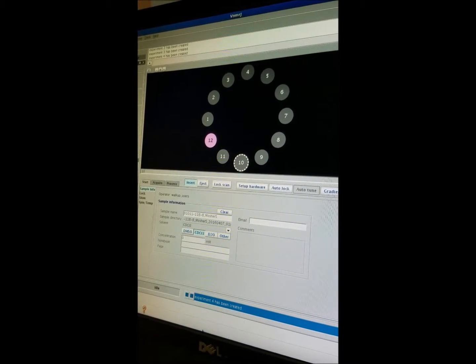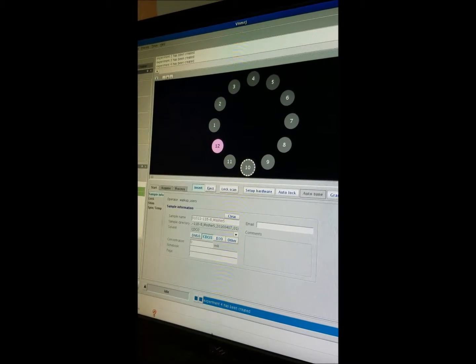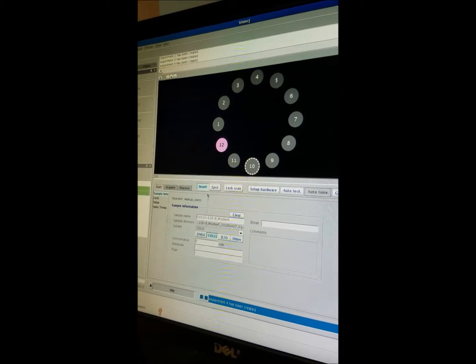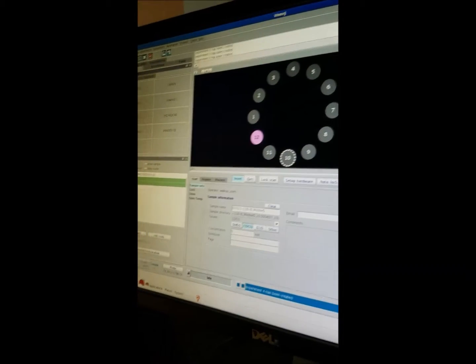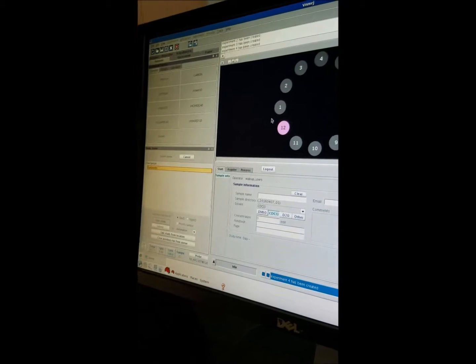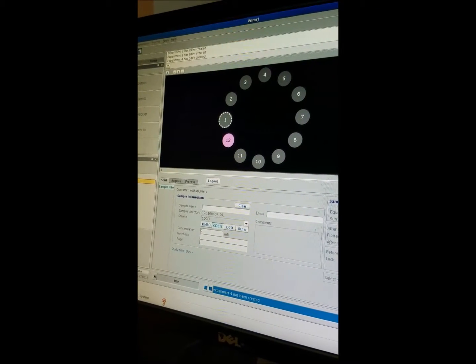So now you have to go in and put in your sample information for each sample, and you have to tell the NMR what experiment that you want to run. At this point, we come down here to New Study, down at the bottom left, and we click New Study. When we do that, we'll click the sample holder place, and then we'll run Proton.